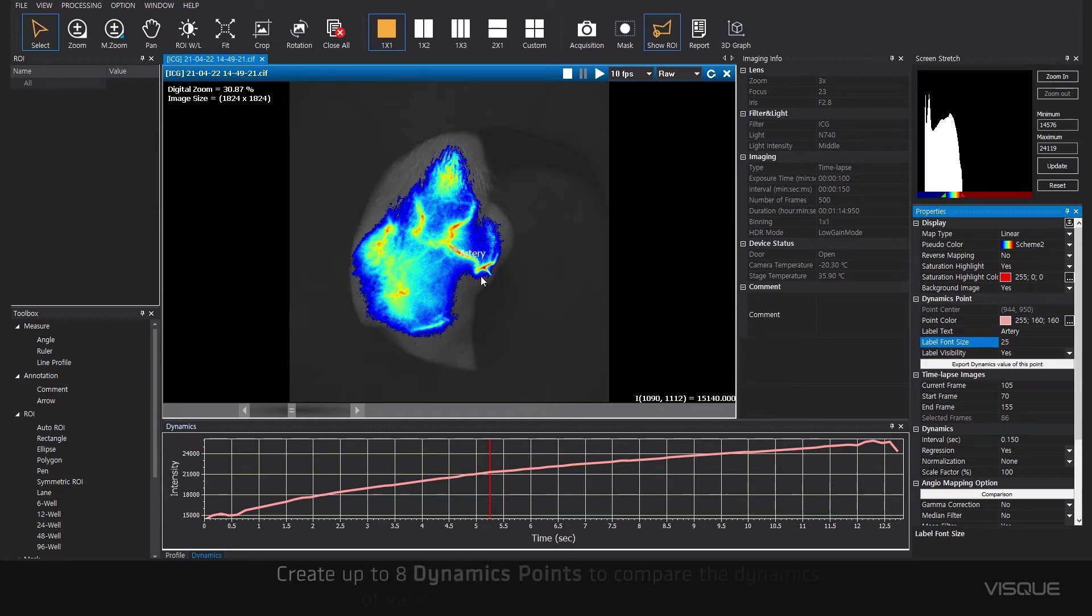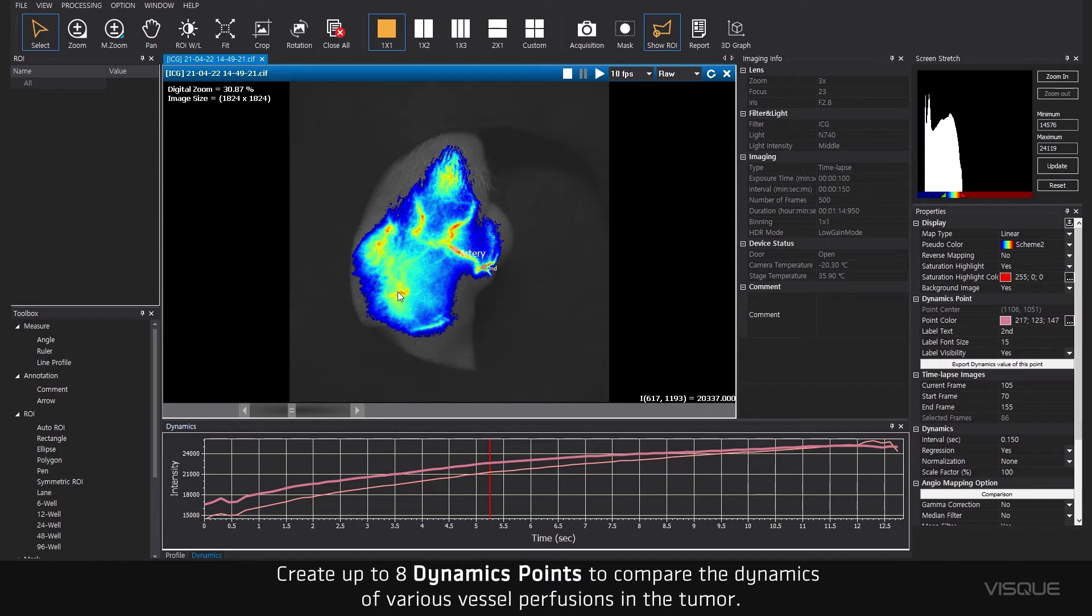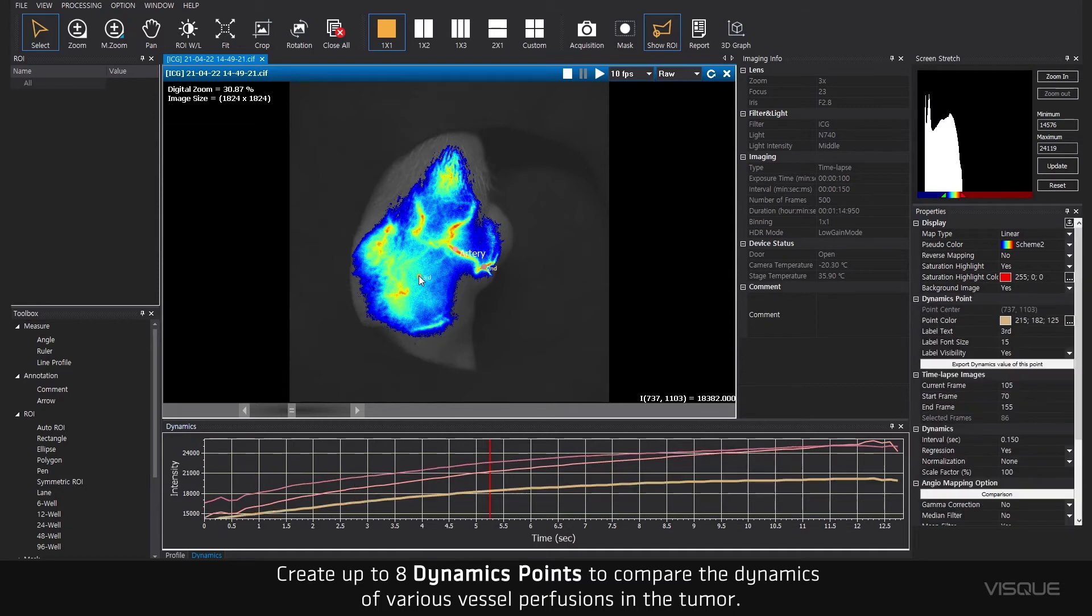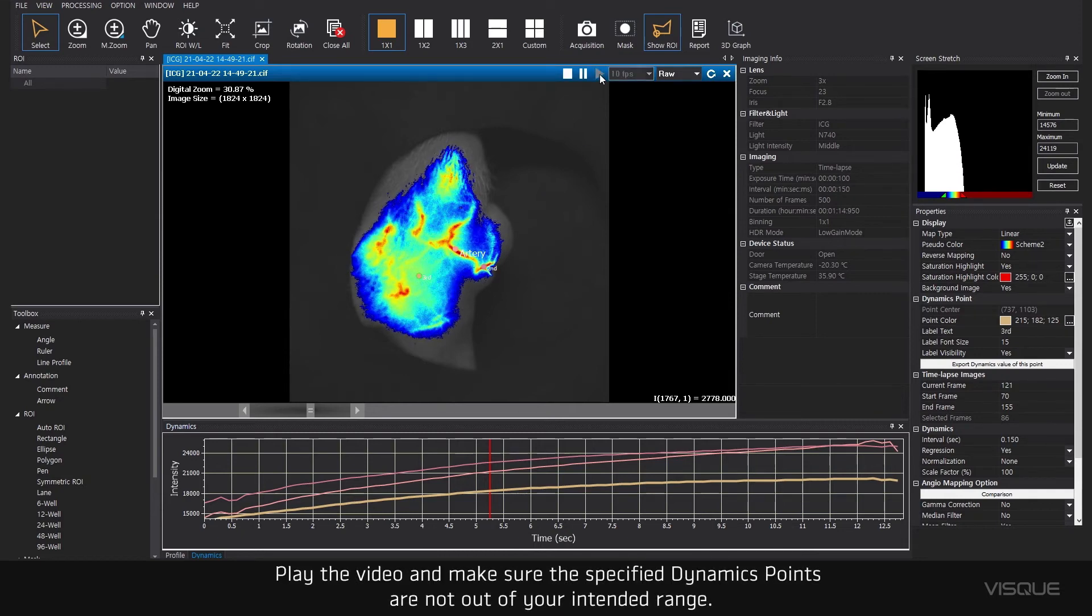Create up to 8 dynamic points to compare the dynamics of various vascular perfusions in the tumor. Play the video and make sure the specified dynamic points are not out of your intended range.